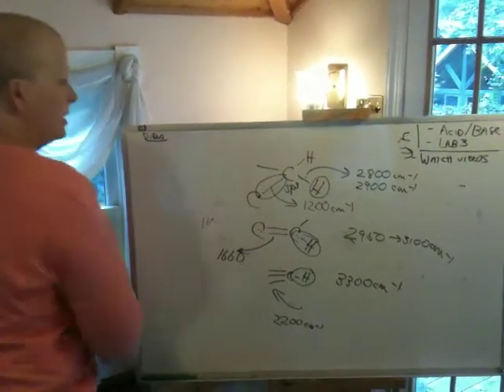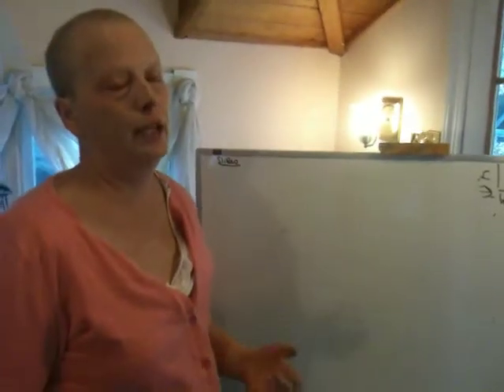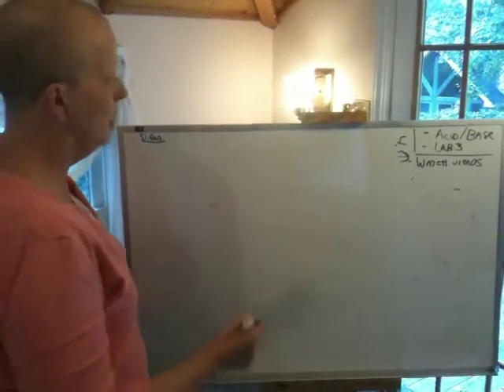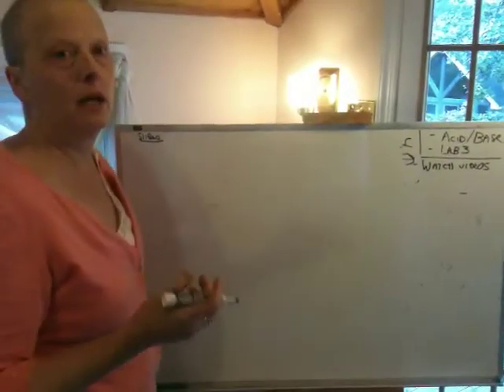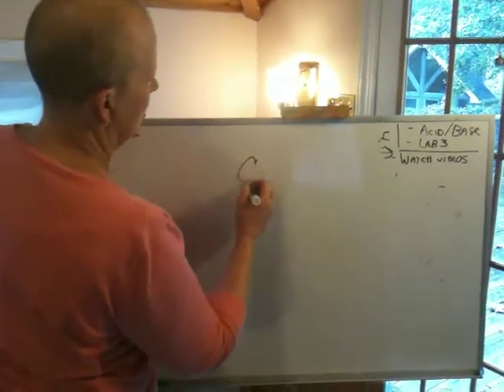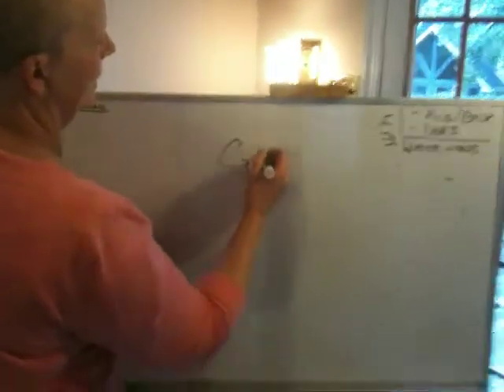Okay, so the first compound we're going to look at, and there's this thing I like students to know how to do, which is called the unsaturation number, and I'll probably send you a video out on how to do this. But propanol is a saturated compound. And the way we do these spectroscopy problems is we usually work with the formula. Propanols have the formula C3H8O.